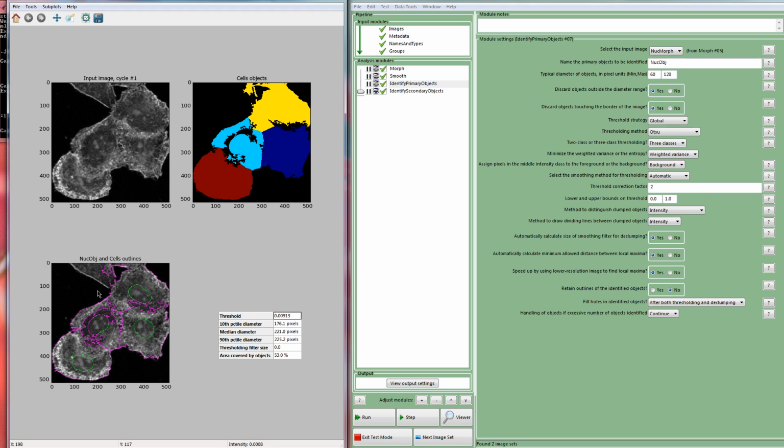Once you've done CellProfiler analysis a couple of times, when you go to the microscope, you'll pick the region of interest in the frame, the field of view, to suit the analysis. You're going to try and crop in different places. You're going to try and surround the cells in different ways. Once you've done it a few times, you'll realise which things are a headache and which things on the borders are a bit of a pain.